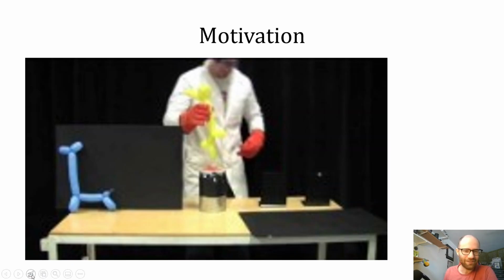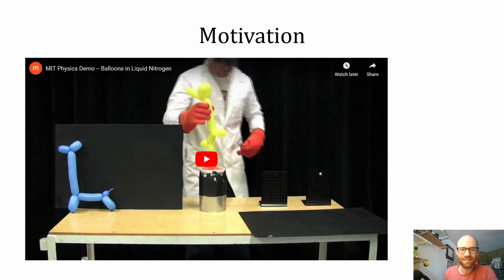Go ahead. We're going to get ready. We're going to write down our observations. I'm just going to hit play.